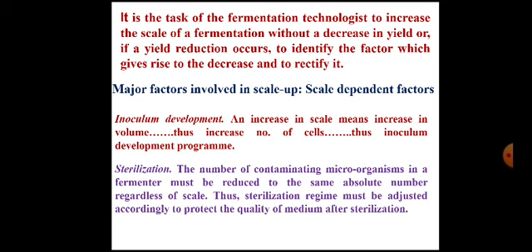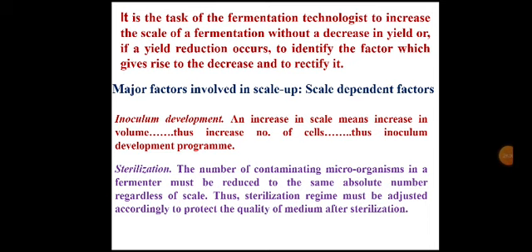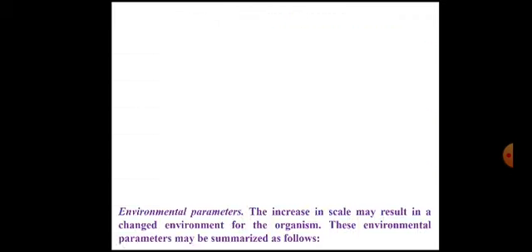So the sterilization criteria or the design of sterilization should be done at higher scale, and whatever data is obtained from small scale should be further studied for the sterilization of medium to be used at the next level. So sterilization is a scale dependent factor. We'll be studying scale up of sterilization in detail in the latter part of this chapter.